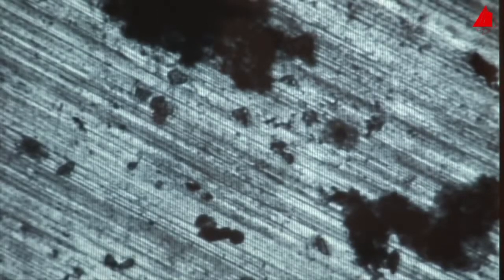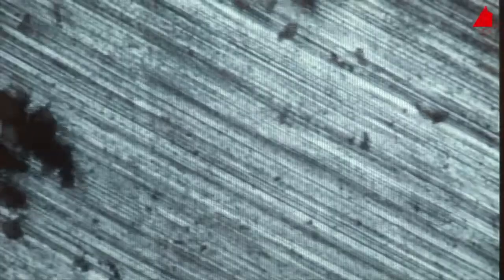After bringing the test piece surface into focus, he selects the exact spot where the hardness test is to be made.